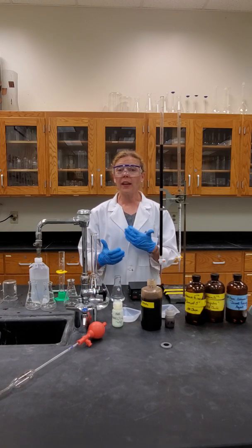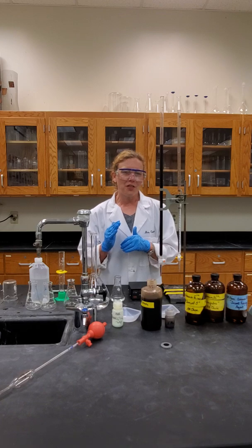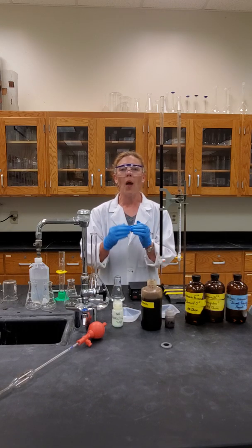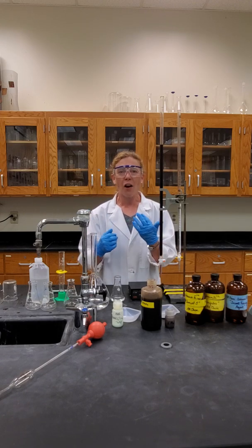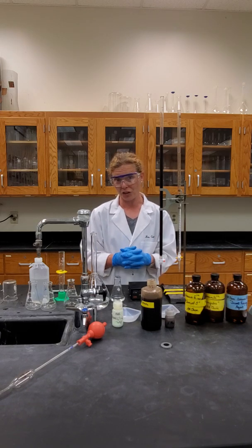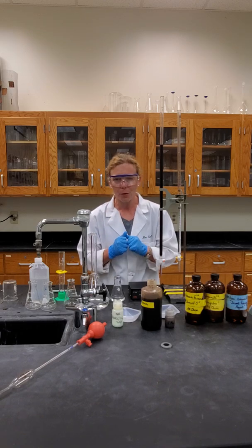Redox titrations. This lab will go over the guidelines of our very first redox titration. Usually we associate titrations just with acid-base reactions, and often we are utilizing an indicator to signify when we've reached the stoichiometric point. Not with this lab. This lab involves a reducing and oxidizing agent that in and of themselves will undergo a color change to signify the equivalence point for us.